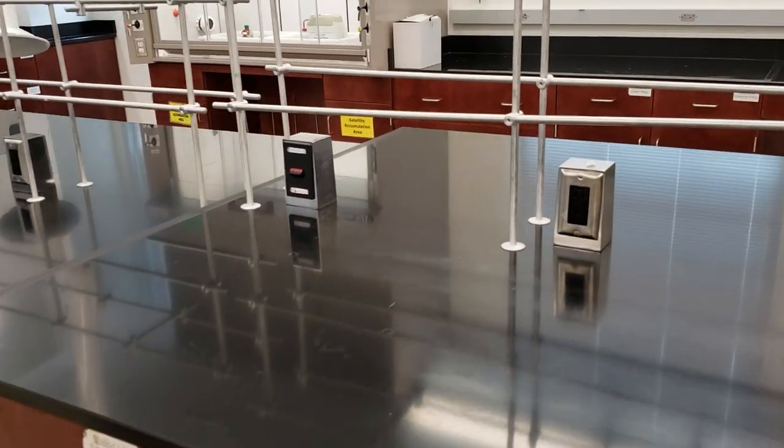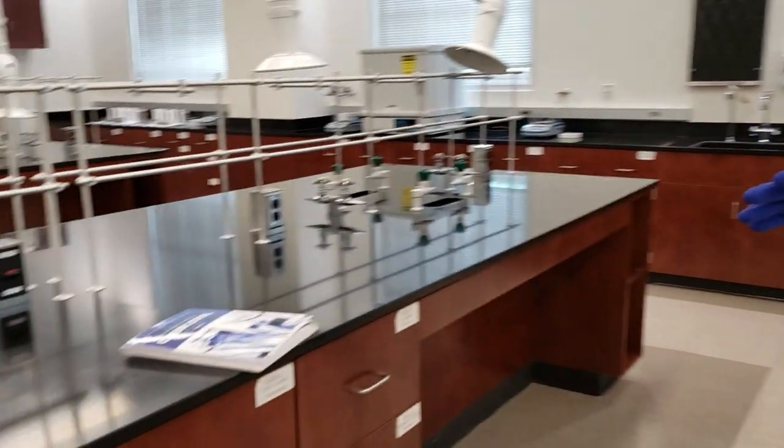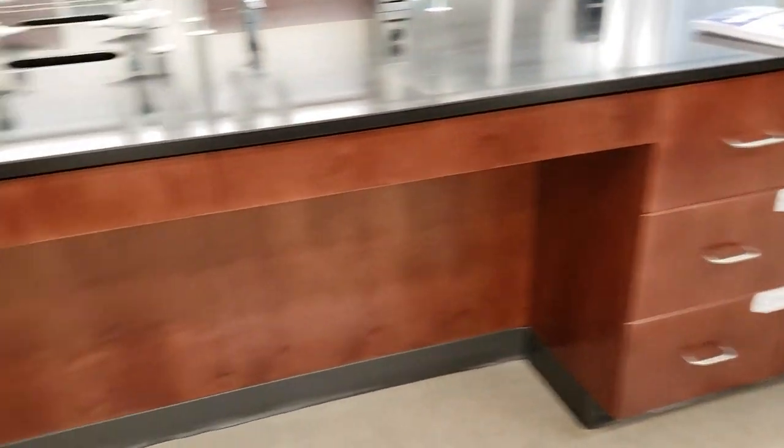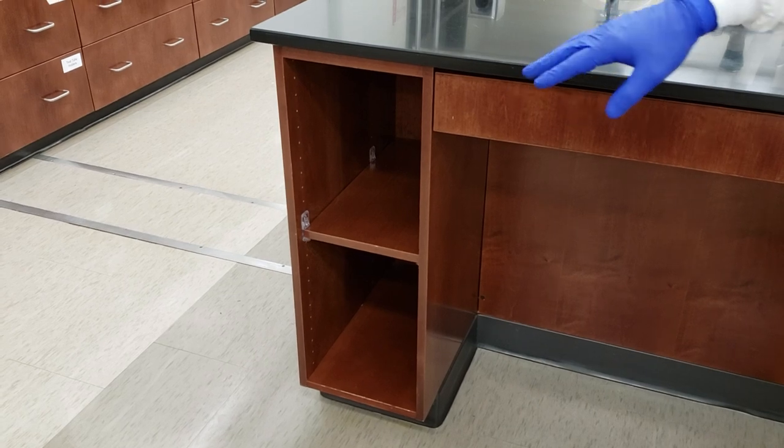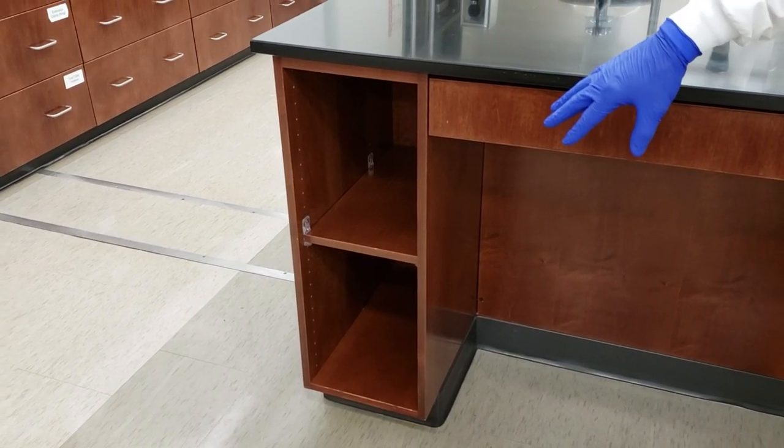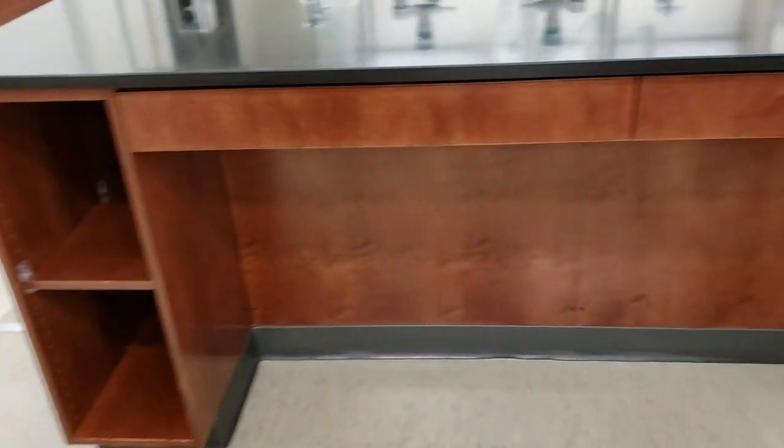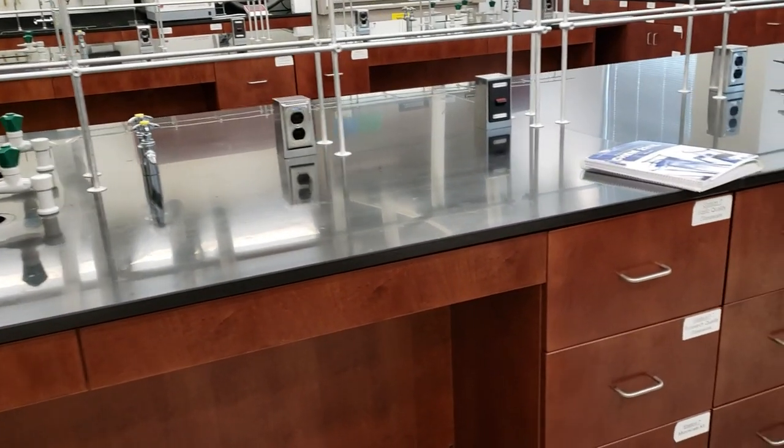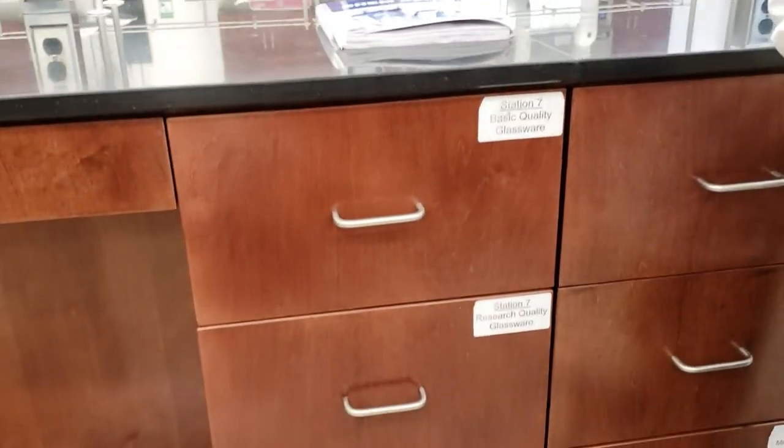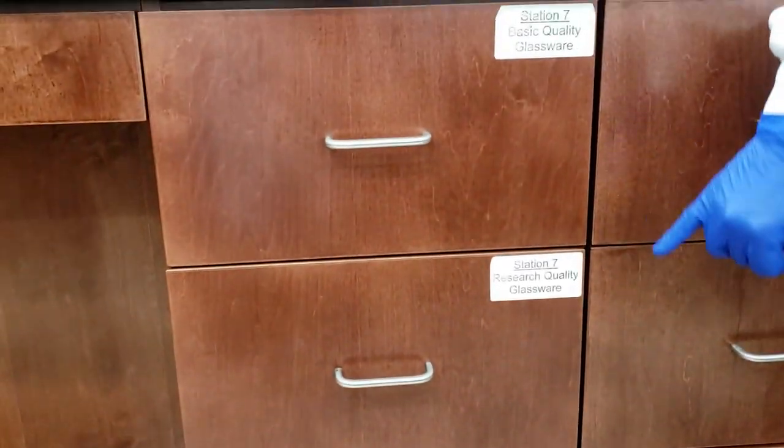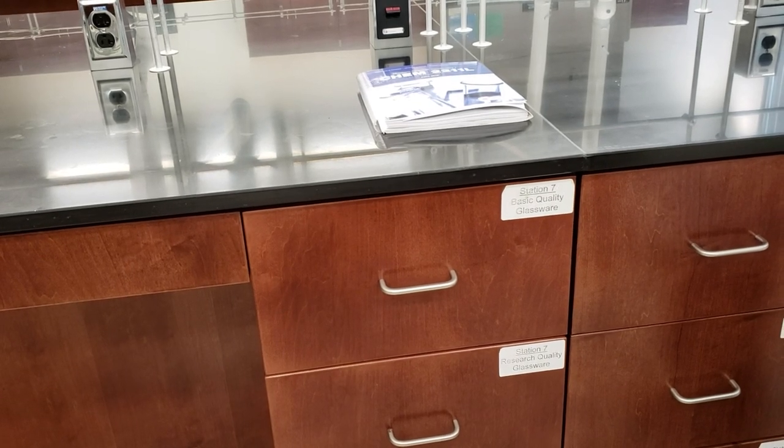As far as individual station setups, each lab station has two cubby holes for students' backpacks. We'll never leave personal items on the floor. Then each station is given three drawers: basic quality glassware, research quality, and microscale. We're going to go through each drawer and show you what's inside.